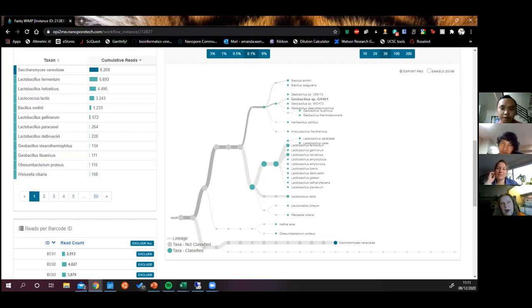I think I'm an advocate for whole genomes just because I don't entirely trust 16S and similar things to be as accurate, although it depends what database you've got. If you have the data for all of the whole genomes, then use the whole genomes. If you've got a more extensive database for a marker gene, you may as well use the marker gene. It's really up to you. You could try it with both, see how it looks and compare them. If you have the data, go for the whole genome.